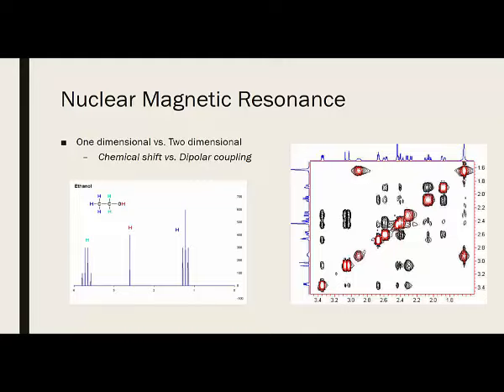As opposed to chemical shift, 2D NMR is based on dipolar coupling. The two dimensions are two frequency axes that represent a one-dimensional chemical shift. Essentially, a single 2D spectrum is generated by a series of 1D experiments, and the resulting plot shows cross peaks that connect resonances from hydrogen atoms that are spatially close together. For example, a nucleotide base hydrogen to its 1', 2', or 2" hydrogen.